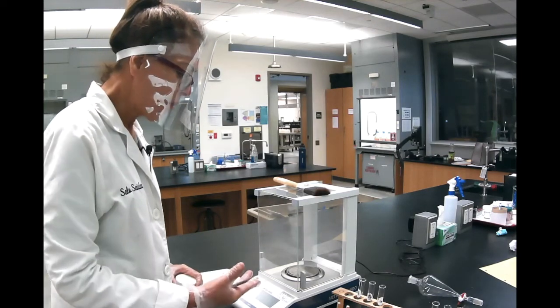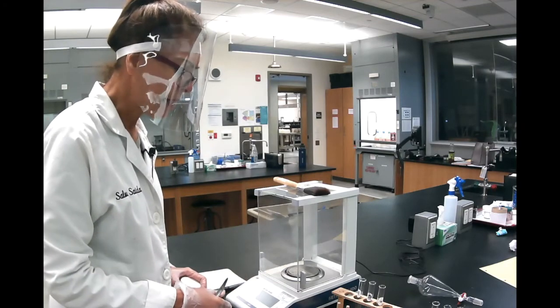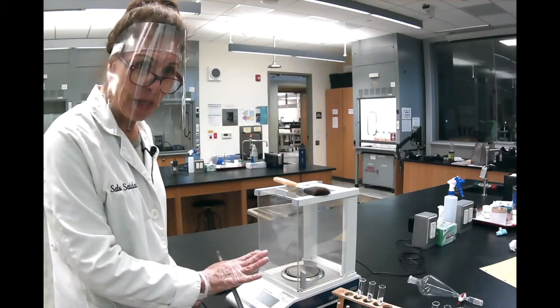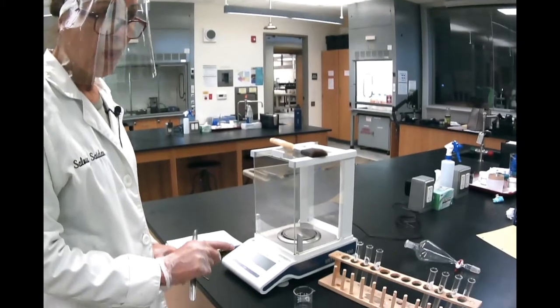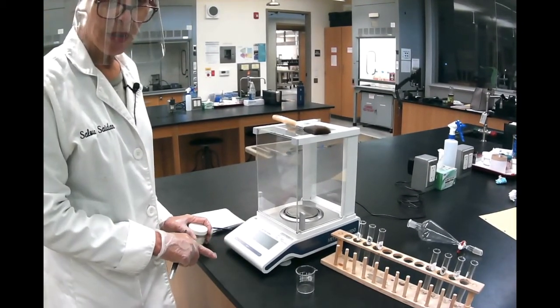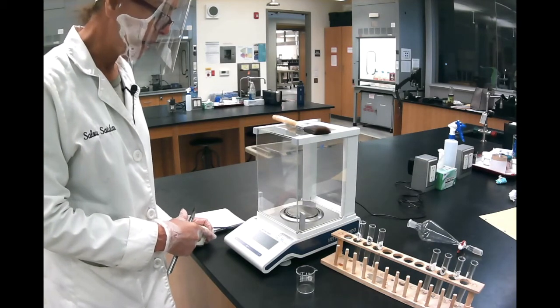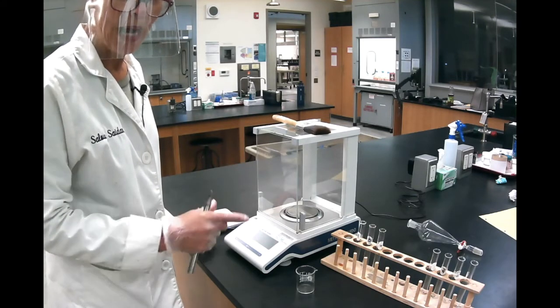So how do you weigh? First of all, use an analytical balance like this one. I want you to notice that it's completely clean and everything is perfect. It's reading 0. We never know when was the last time they calibrated this machine. So ideally, if I don't know when it was calibrated, I would never tare the balance. I always weigh by subtracting.